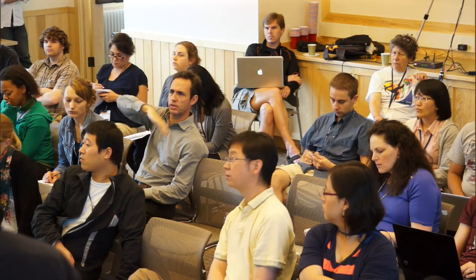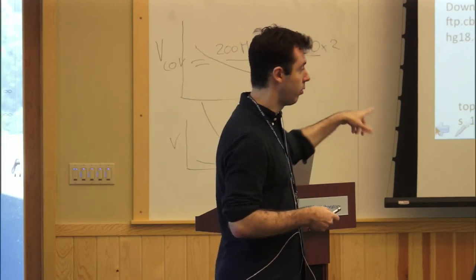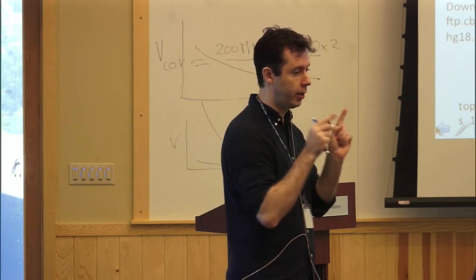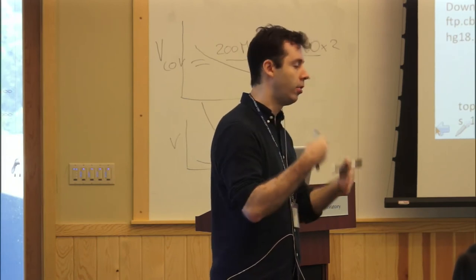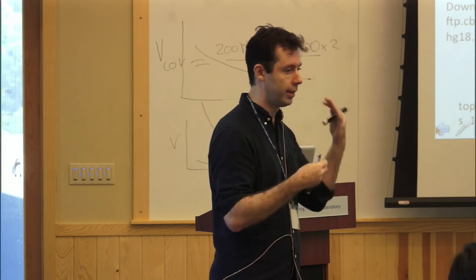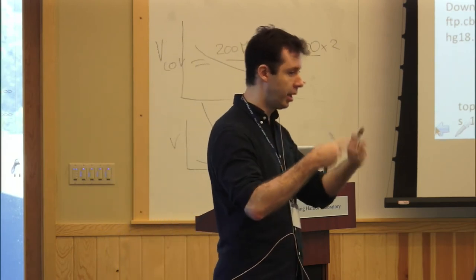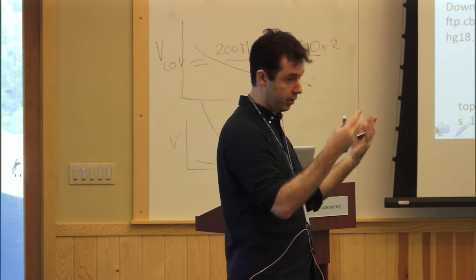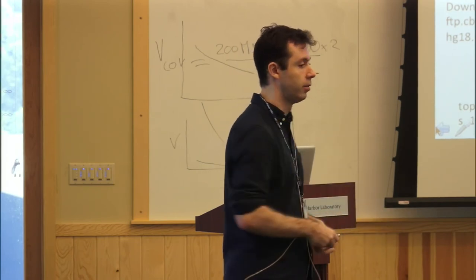That's kind of weird though, right? Because it is a distribution of length. Yeah, exactly, absolutely. You basically have to specify the average. In practice, what we do in my lab is estimate this number. We estimate it by aligning paired RNA-seq reads to a database of transcripts from RefSeq, typically. Often you have to look at the gel, and sometimes the average is actually not so easy to find in the gel. It's kind of a smear. So we estimate it ourselves by mapping the short reads to a database of transcripts, calculating the average insert size in those transcripts, and then using that information back in TopHat for this parameter. It's a bit longer, but it helps.